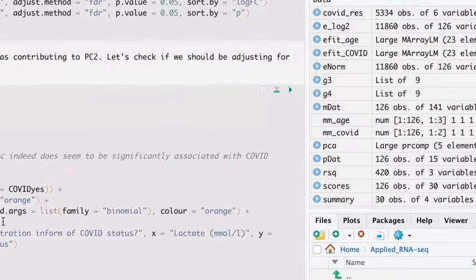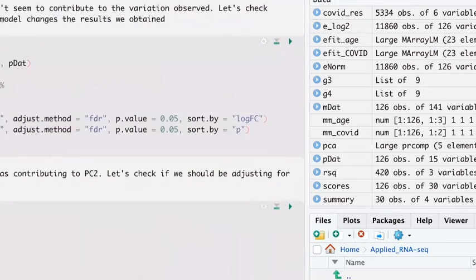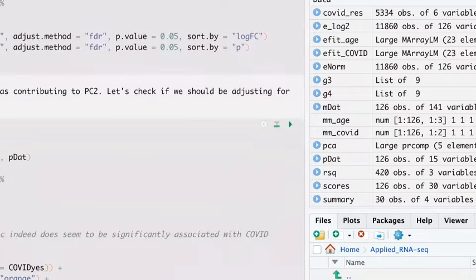So I'm going to run through the same functions again. I'm doing these reiterations just to show you how the model changes according to the variables that you add. So it's very important to be conscious of the variables that actually go into your model.